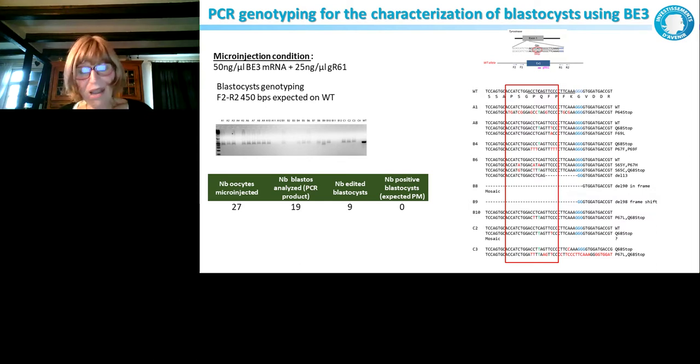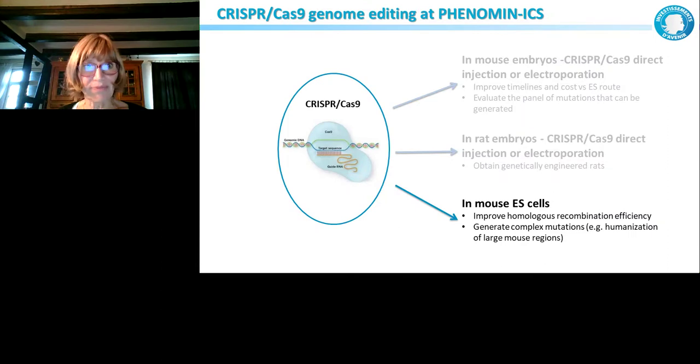I addressed here that perhaps we could have mutated the Cas9 to dead Cas9 and perhaps we wouldn't see indels, but we won't test that again, because honestly, I'm not convinced that base editing is the future of CRISPR-Cas9. For the moment, it still needs to be more precise and improved. Okay, that's all for base editing.